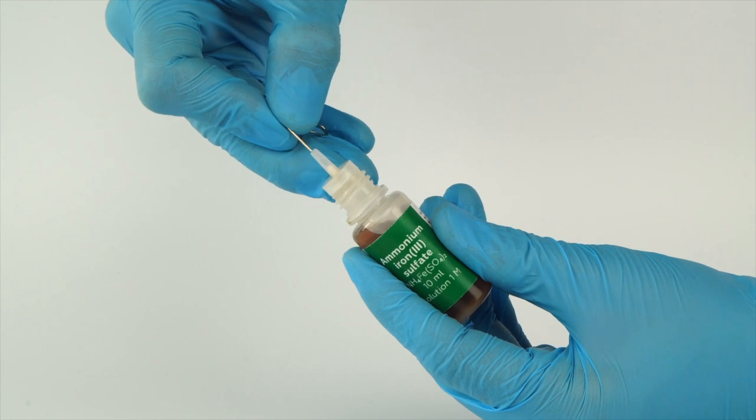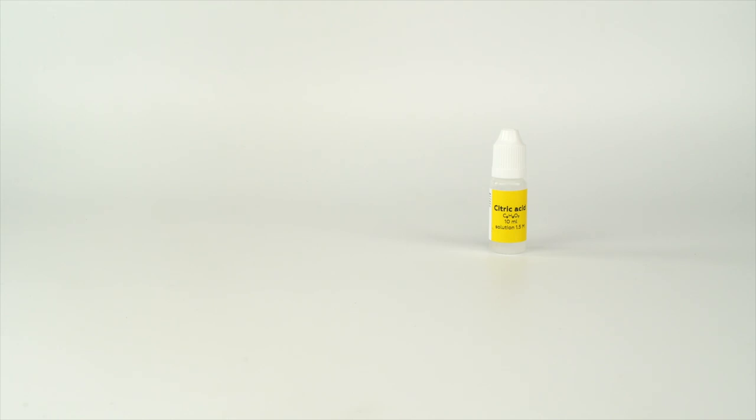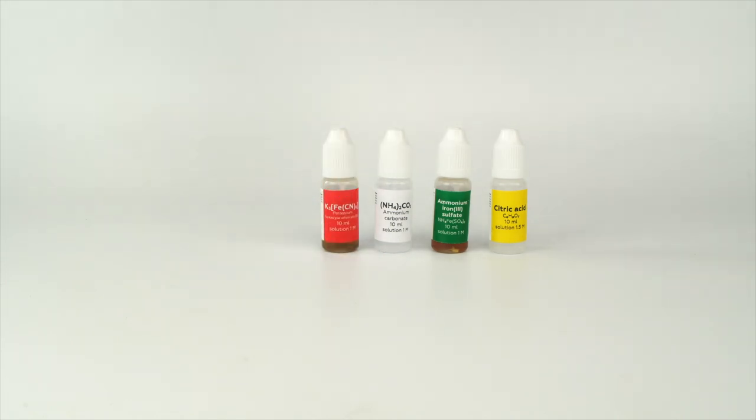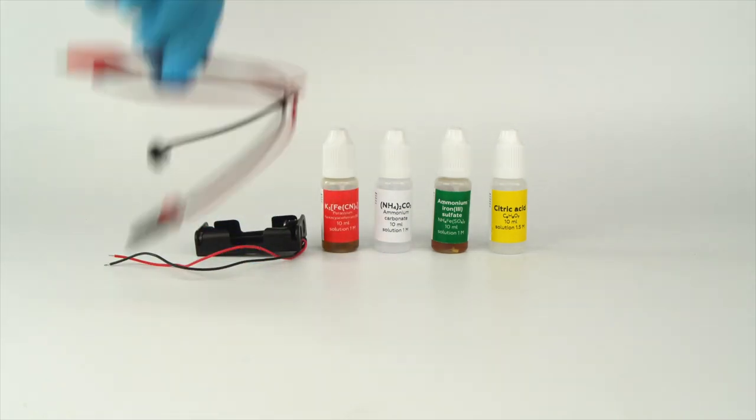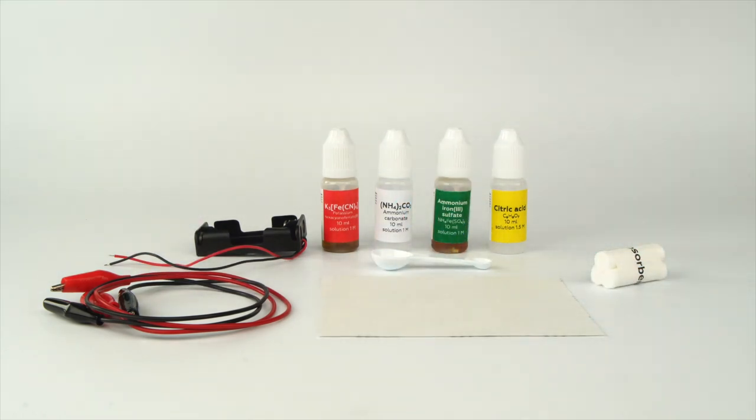Pierce the bottle nozzle with an unbent paperclip. For the drawing and light experiment, you will need four solutions: citric acid, ammonium iron 3 sulfate, ammonium carbonate, and potassium hexocyanopherate 3. Take the battery holder, the crocodile clips, a measuring spoon, a piece of watercolor paper, an absorbent, and the LED from the experiment set.